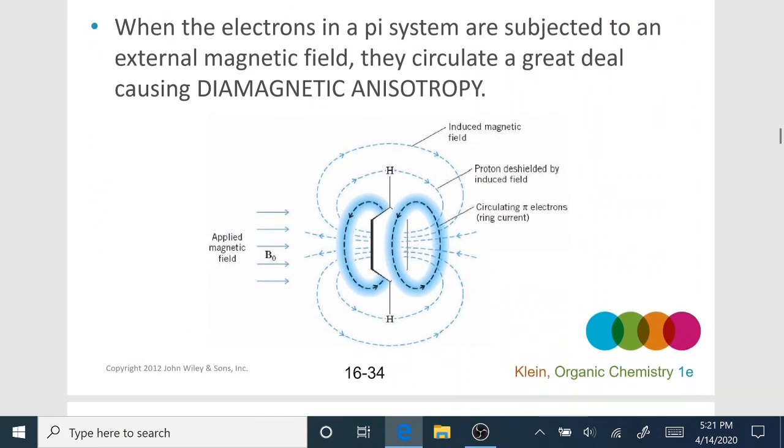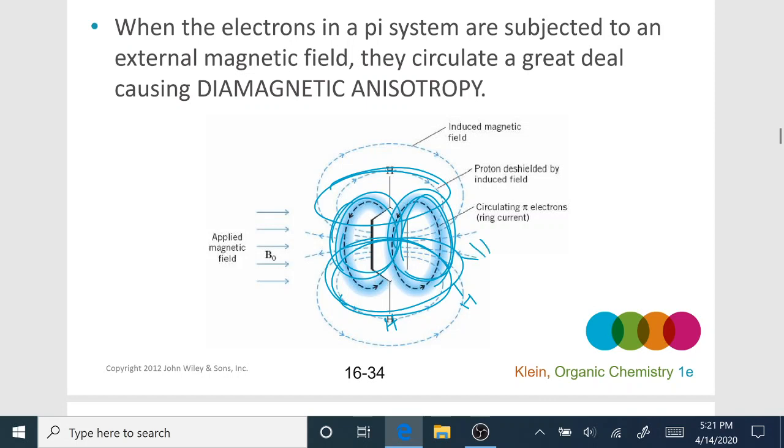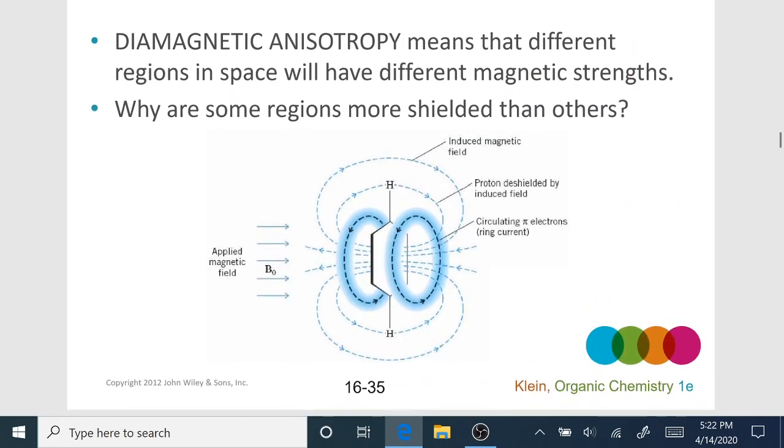signals. Now, talking about the aromatic system, we see those at around 7 because they're deshielded due to this diamagnetic anisotropy. And that's because of what's called a ring current. So that's also called a ring current that actually exists in the benzene ring. Okay, and so the hydrogens that are on the benzene ring stick out from that circulating current that's on the ring, and I've drawn too many hydrogens on there, but anyway. So since they stick out, they are deshielded by that effect, and so that's going to make the hydrogens that are on a benzene ring, just know they come in at around 7.